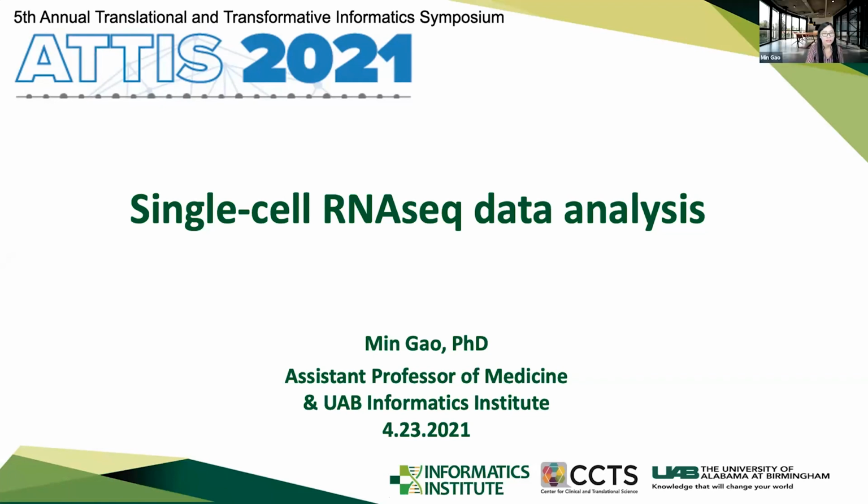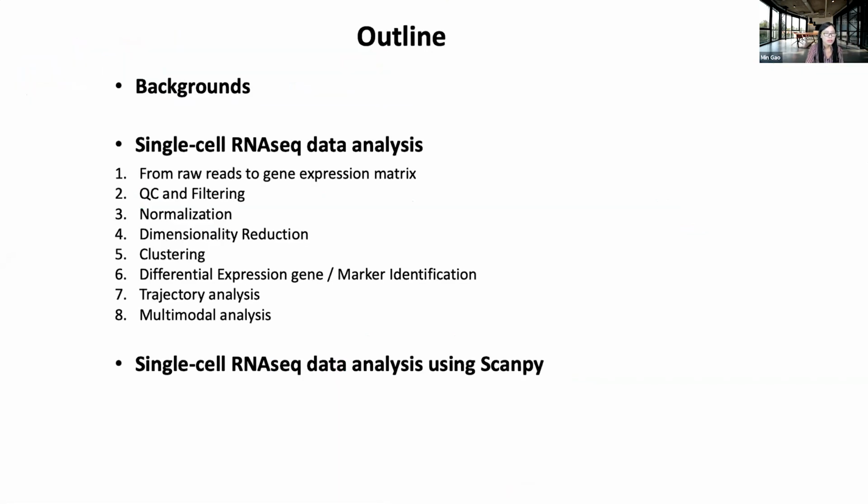Hello, everyone. This is Minggao. Welcome to the single cell RNA-seq data analysis workshop. I'm from the Informatics Institute. Today, I will talk about single cell RNA-seq data analysis. This is the outline. At first, I will give a short introduction and overview, and then I will show the different steps for working on a single cell RNA-seq dataset. And finally, I will do a demo for analysis of single cell RNA-seq data, using the Python package Scanpy.